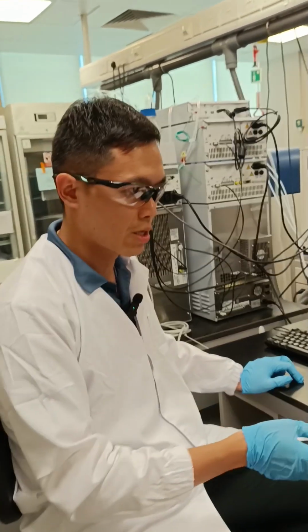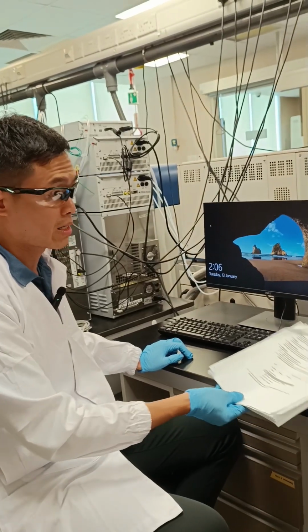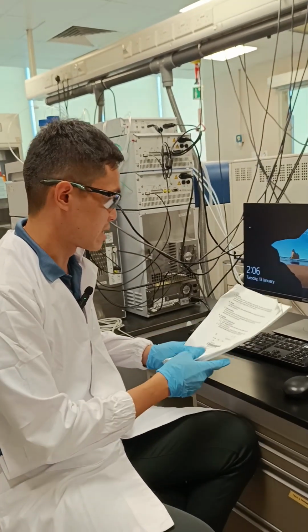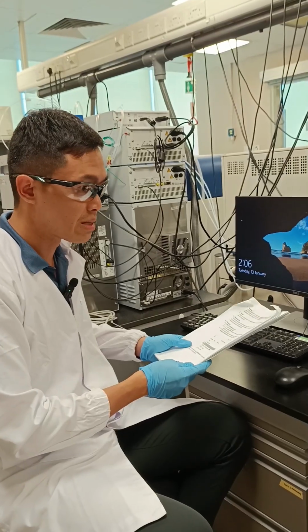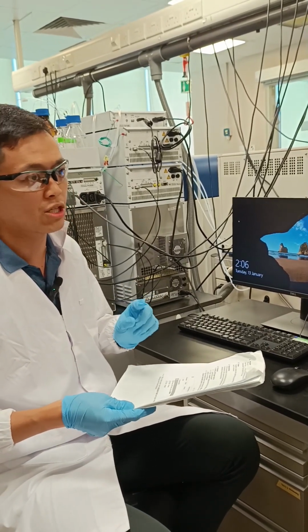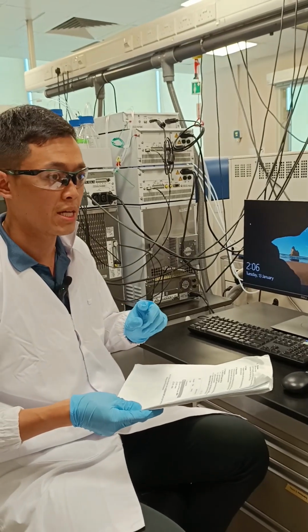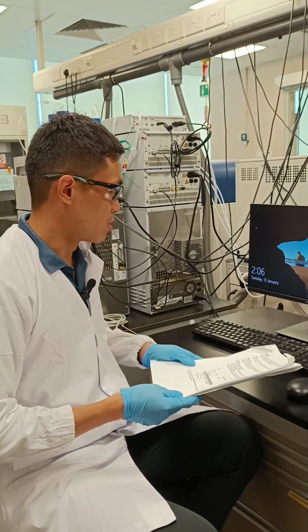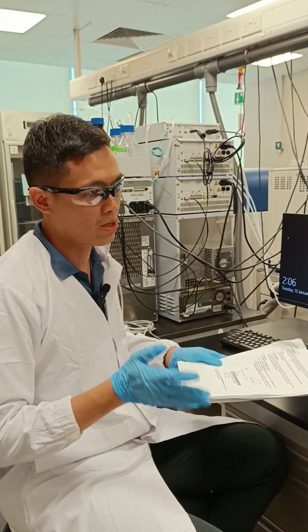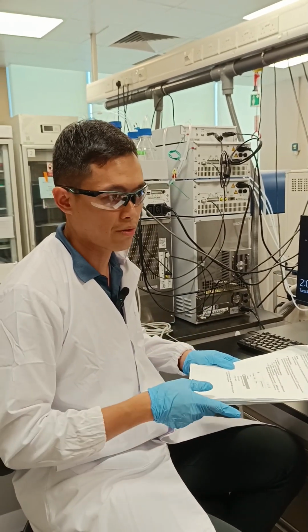But you guys are trying to target all these drug-related compounds, right? Cool. I think the protocol, everything will be pretty much similar, except the extraction might be a bit different, which I assume you guys have your own protocol for. So you guys have to figure it out. I can send mine to you, but I think it will be totally different. That will be just for your reference.